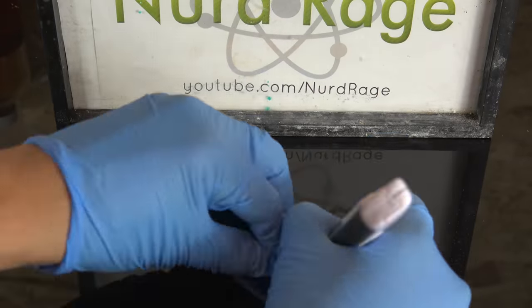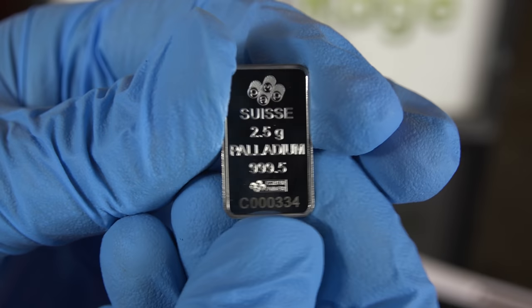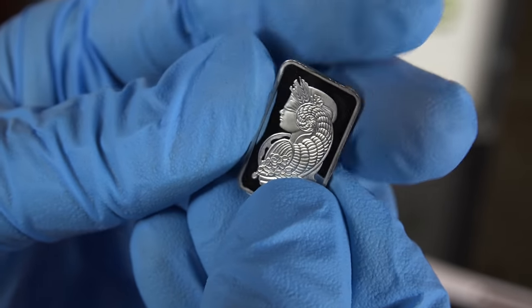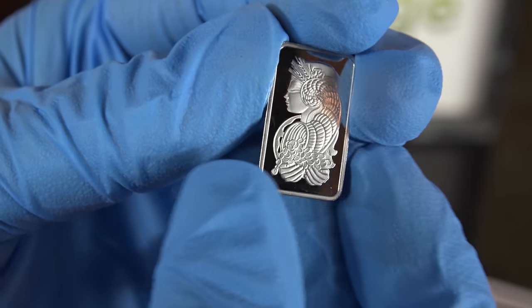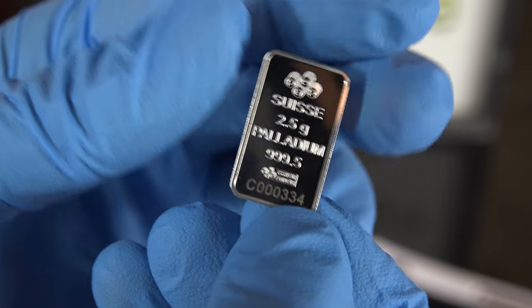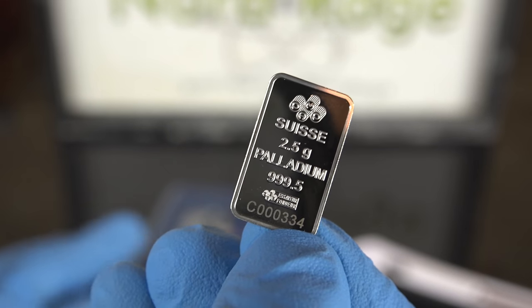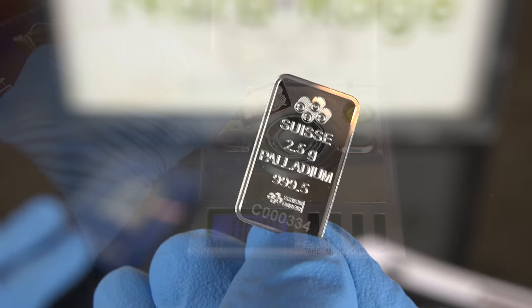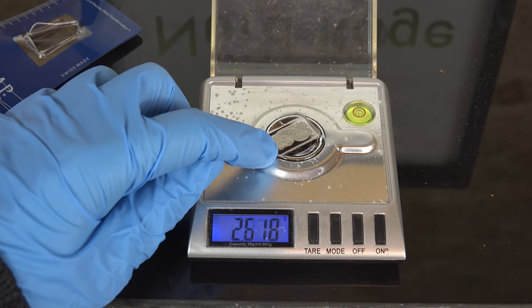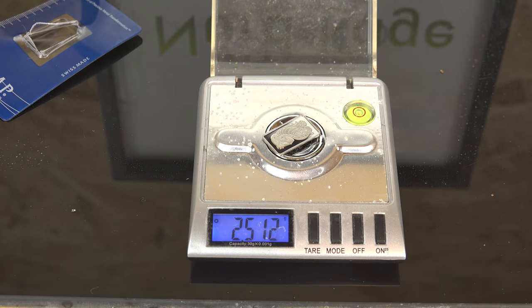Let me cut off the packaging. And there we go, one 2.5 gram bar of palladium metal. On the back side we have the Pamp Suisse Lady Fortuna design. Let's see what chemicals we can use against it. But first we should weigh it. This is a pretty small piece so it will be hard to judge how deeply it's getting damaged. If we know the mass beforehand we can see how much it changes and we can notice even small amounts of damage that are invisible to the naked eye. Looks like we have about 2,512 milligrams.